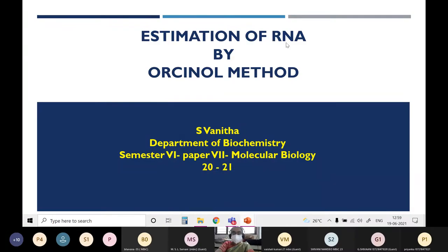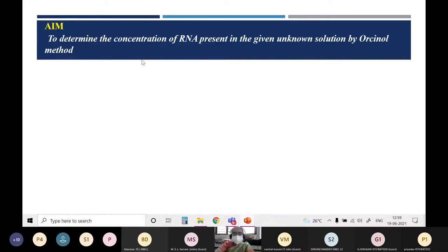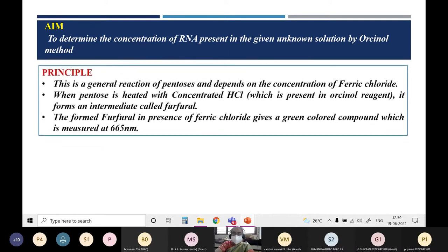Students, today the experiment is estimation of RNA by Orsenol method, a very good method to determine the concentration of RNA present in an unknown solution. The aim of this experiment is to determine the concentration of RNA in the given unknown solution by Orsenol method. You are going to use Orsenol reagent, a green colour will develop, and you will take the absorbance of that green colour to determine the concentration of RNA.